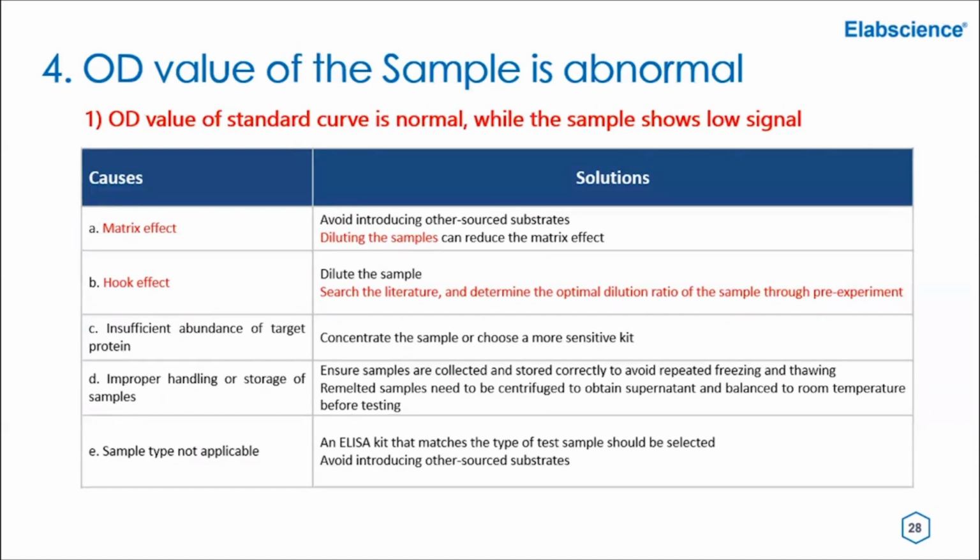In addition, it is recommended to select a high-sensitive kit for the detection of low concentration targets. And for detection of recombinant proteins, please confirm the applicability with our technical support team in advance.